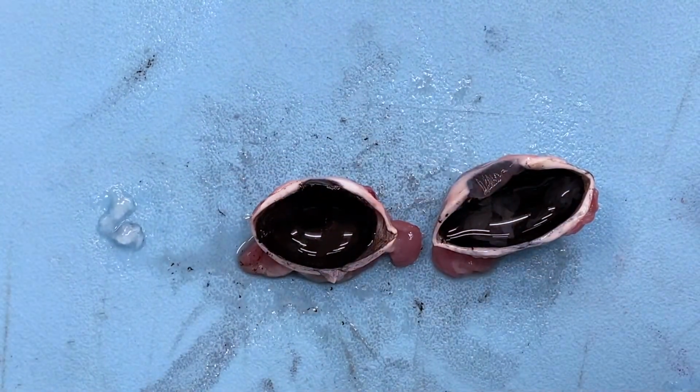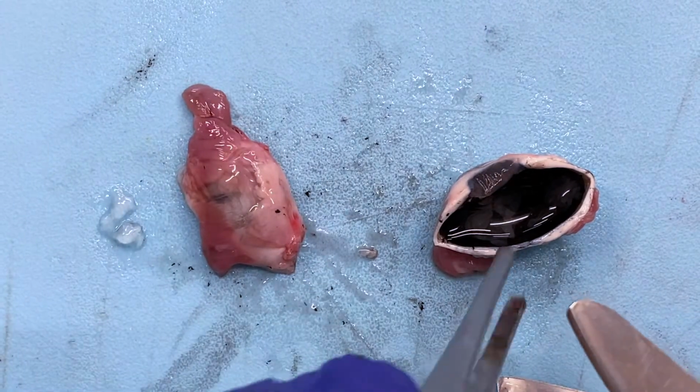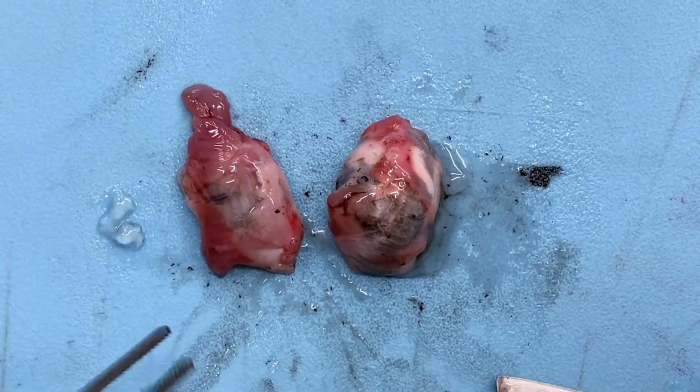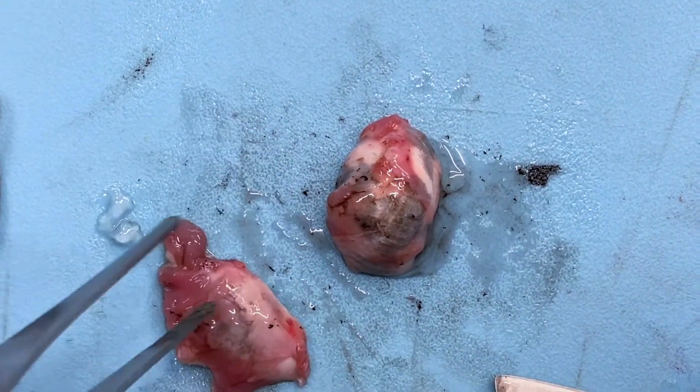Now, if this is for tumor, we can take the remaining portion of the eye, and this is what we're going to assume this case was. These partial globe structures are referred to as calottes. And what we're just going to do is serially section those and submit those in cassettes as well.